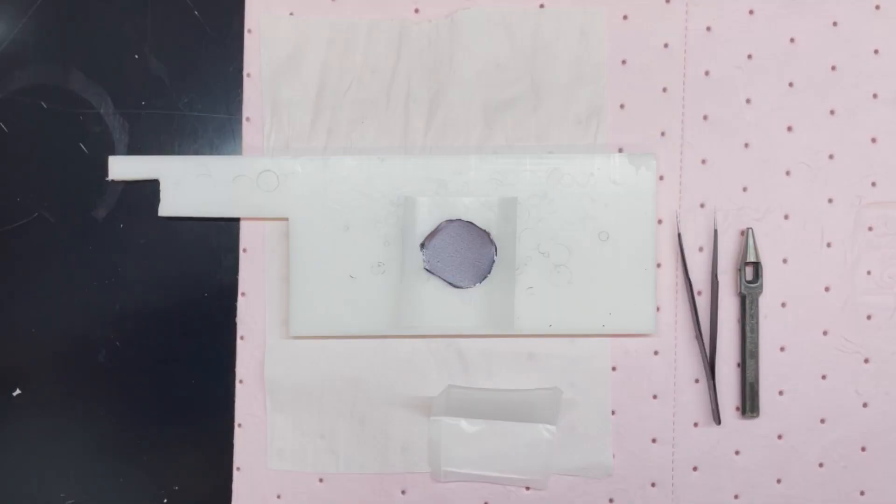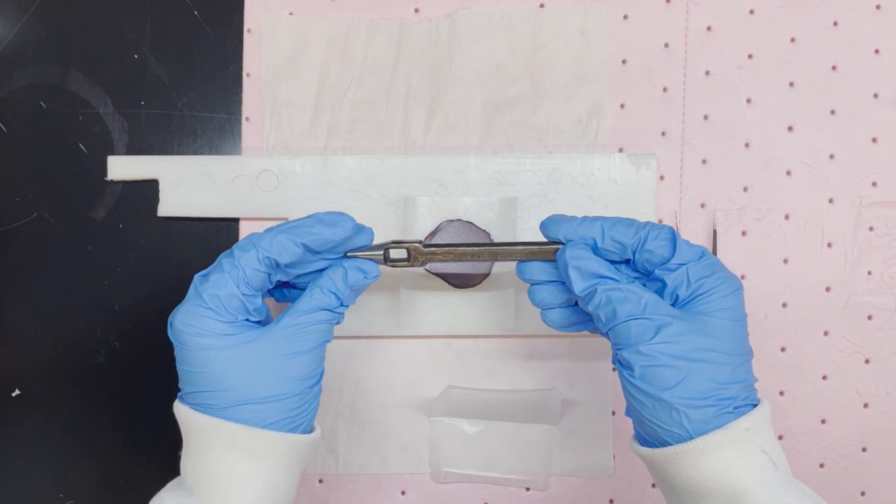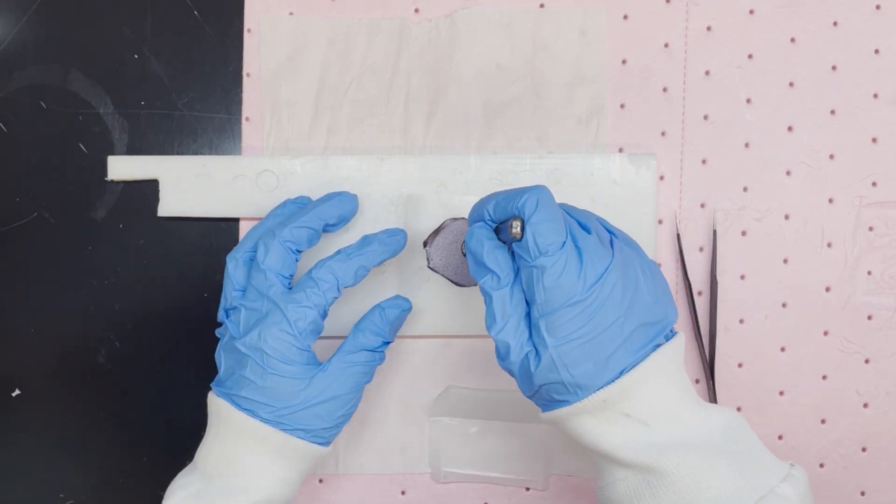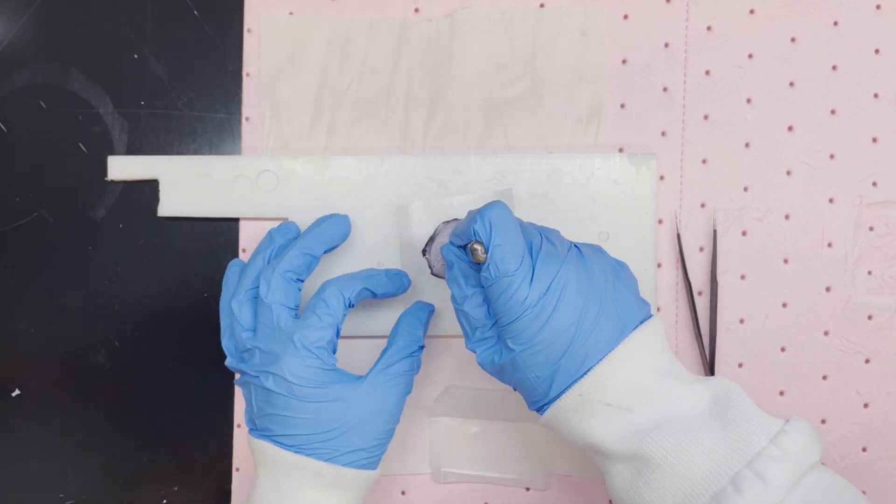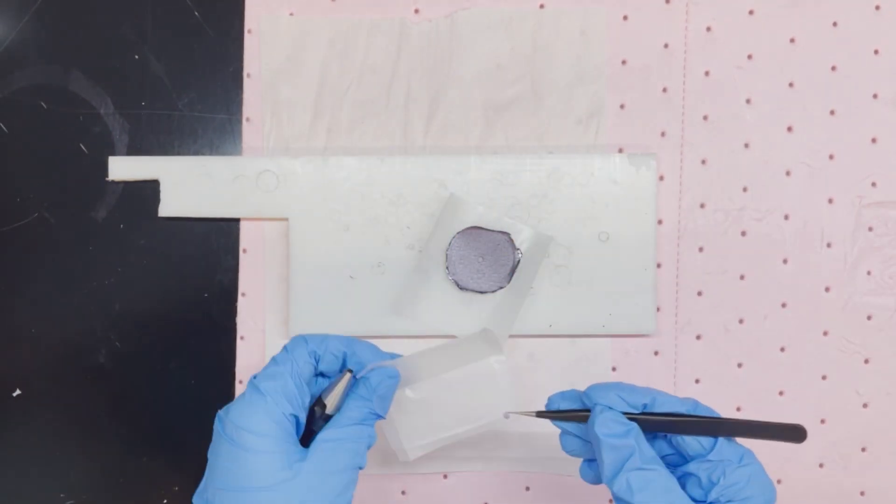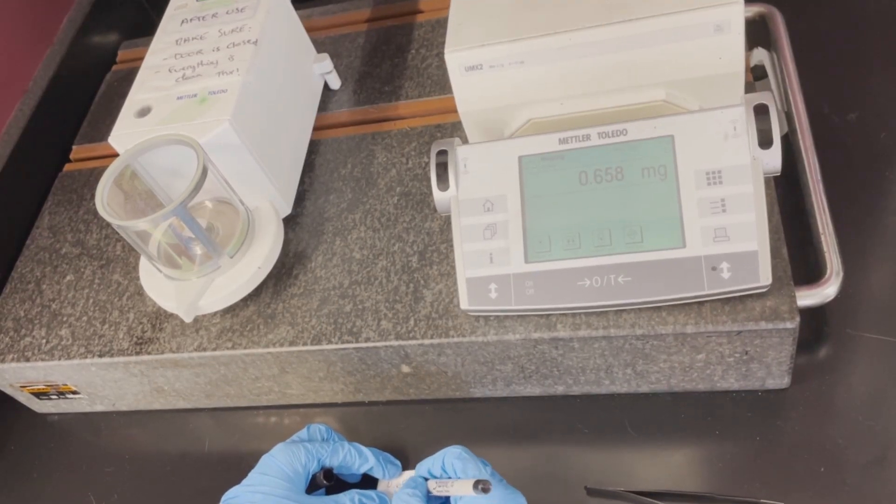Here we first show how to prepare electrodes with specific diameters using the working electrode as an example. For the working electrode, we use a puncture with a three millimeter diameter. A piece of weight paper is put in between the working electrode and the teflon board to keep the material clean. With this setup, we can punch out a circular electrode and measure its mass for gravimetric analysis.